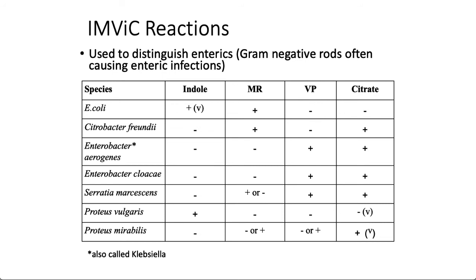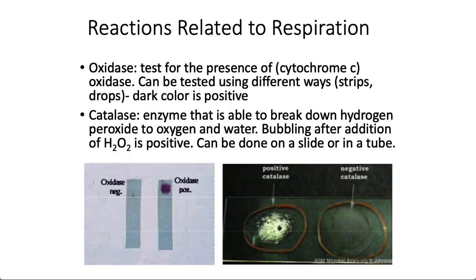I don't think there is, like maybe Enterobacter, Serratia. So some of them are very similar, but then you can use some additional tests in order to differentiate between two, but at least it will give you an idea of who is who.